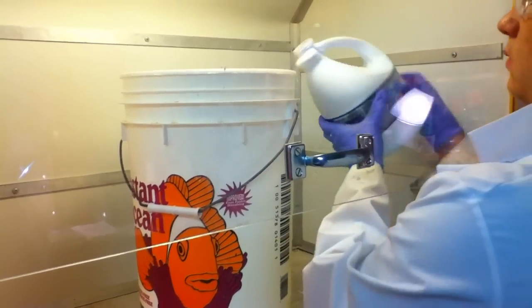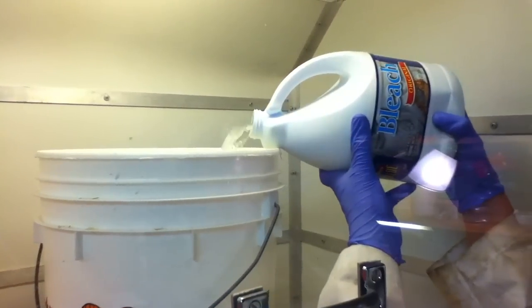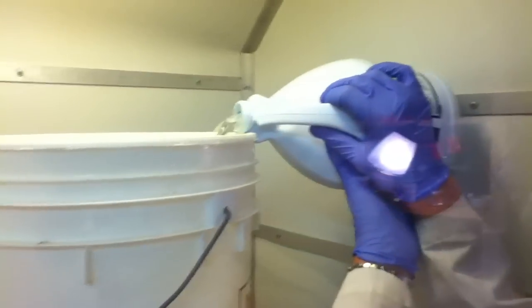First, add 5 gallons of generic store-bought bleach to a large container. It should be the cheapest you can find to have the least number of surfactants and additives.